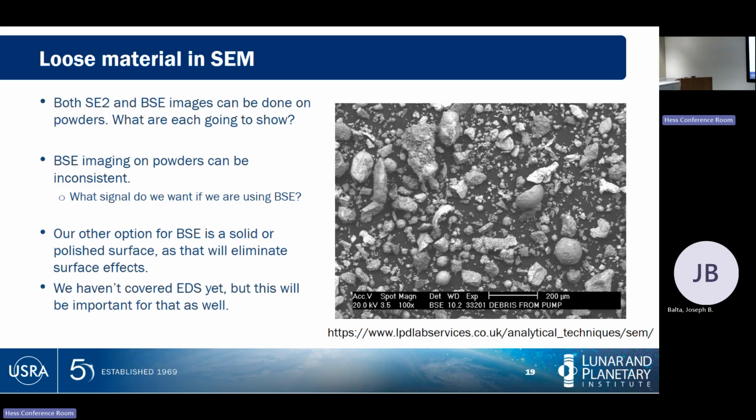So even though these are probably the same chunk, same thing right here, these areas are brighter and darker on single pieces just because they're angled to give the response to the detector. Okay, so we might get usable information out of this.